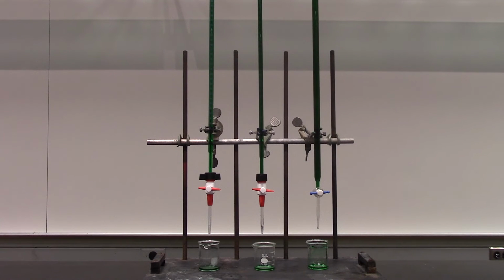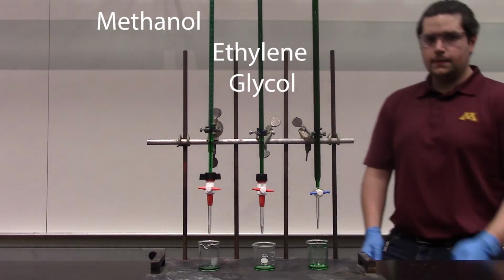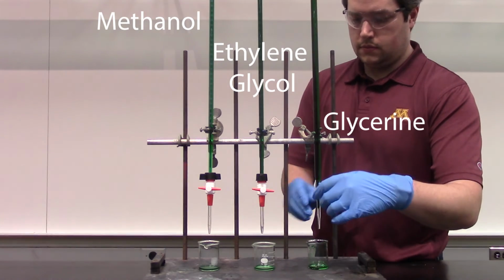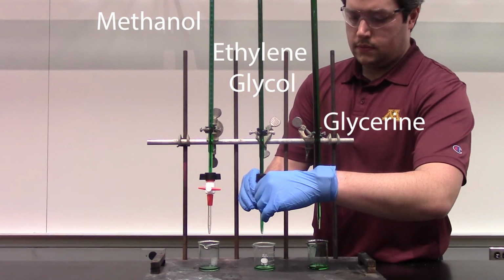To demonstrate the differences in viscosity between these three molecules, we'll see how long it takes equal volumes of the liquids to flow fully out of three burettes. Going from left to right, we have methanol, then ethylene glycol in the middle, and glycerin on the far right. A little bit of green food dye has also been added to the burettes to make it easier to see.